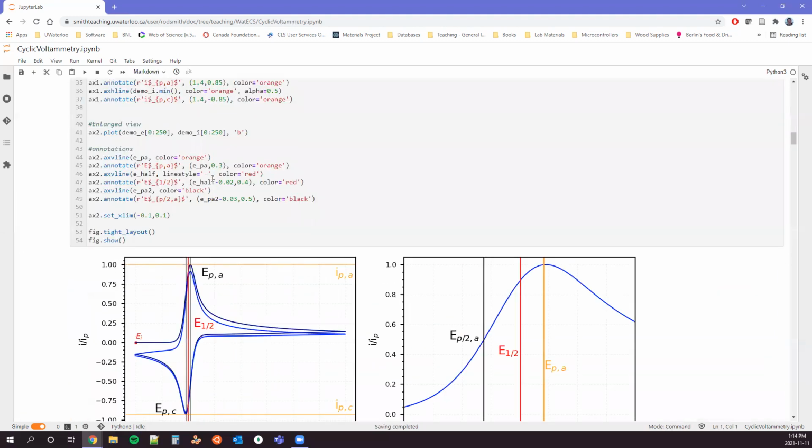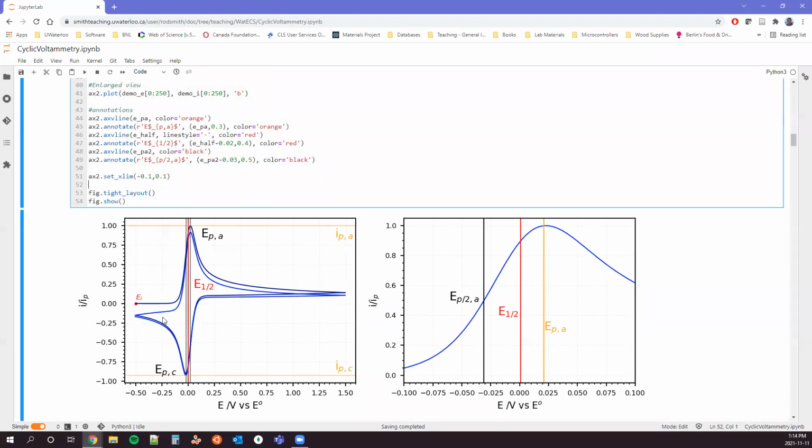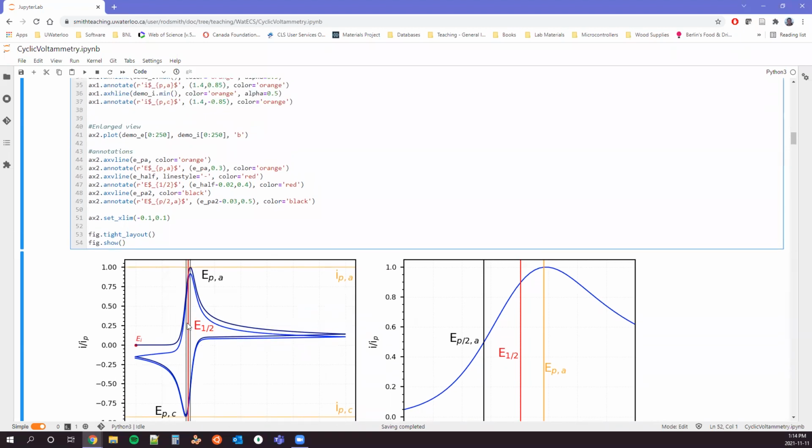So we'll go over a little bit of what we kind of expect to see. Everyone's used to these kind of duck-shaped curves that we see. And I see a lot of people stressing over the fact that they don't get duck-shaped curves. It is very hard to make a nice, perfect, reversible cyclic voltammogram. You know, it's not the end of the world. The structure of that voltammogram is going to tell you something.